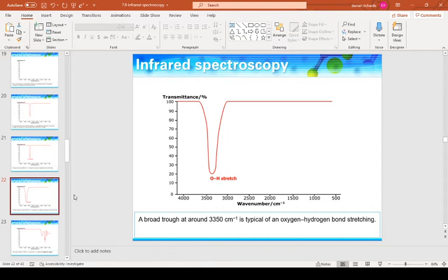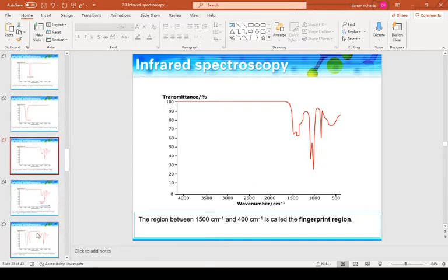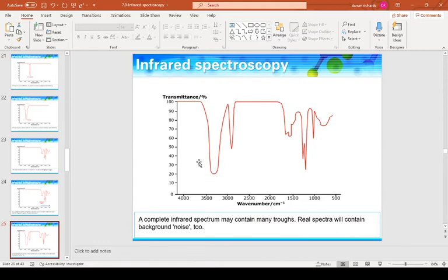And it's a big old, wide kind of absorption trough, I guess. It is a trough, yeah. And then you get something like the fingerprint region. Now, I can't record the other bit, but cross-reference this to your data book, and you'll be able to see. So, for example, this big trough here at 3,400, that tells me it's OH.